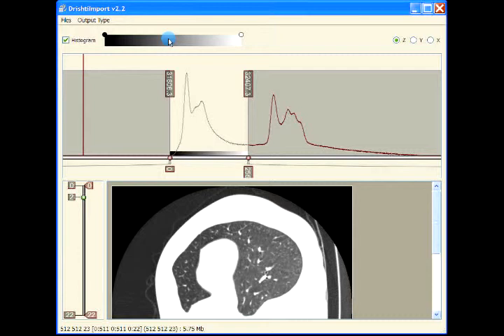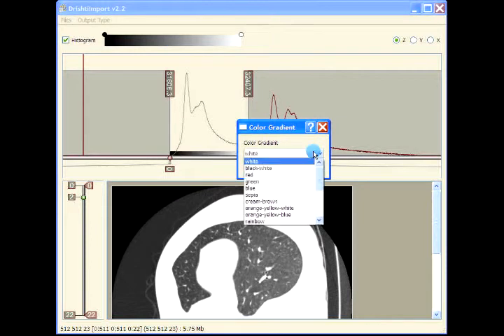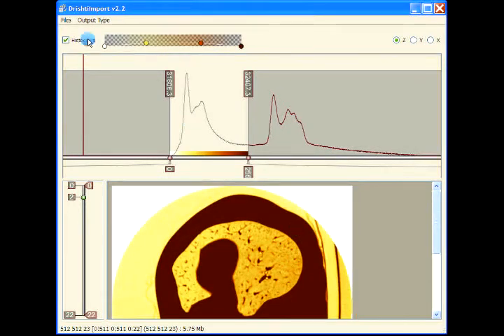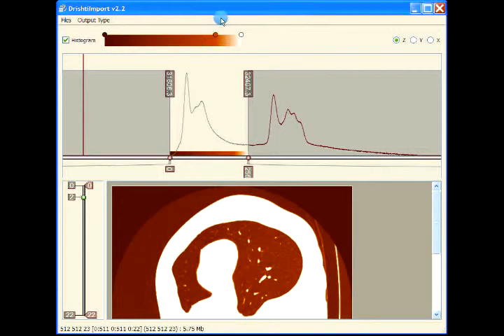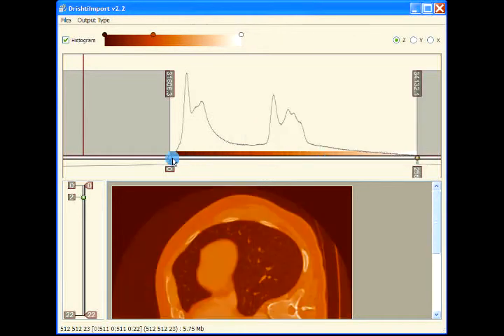This is the same thing as in Drishti, the renderer, where you hover over your color map and then pressing the space bar will bring up different options for the color gradient. And then you can of course change the color gradient to whatever colors you feel like, or remove, and so on. Or you can flip using F and so on. So you can play with the color gradient as well as the markers. Now if you know the exact values for your minimum and maximum, now here I am just moving the markers and changing these minimum and maximum extents for my color mapping.